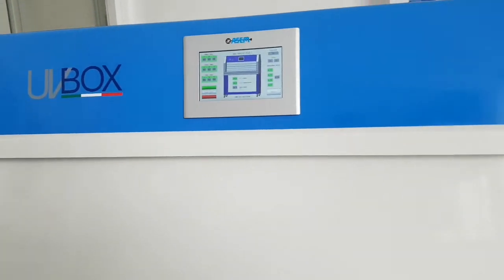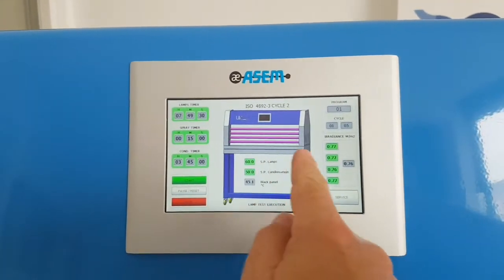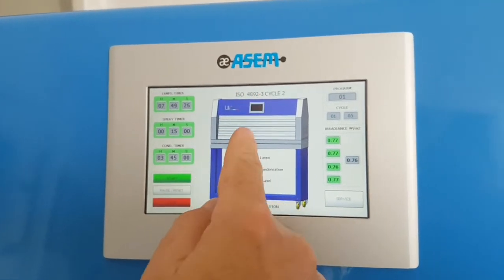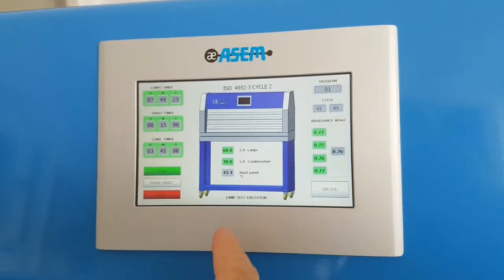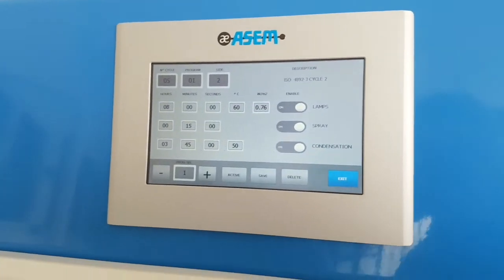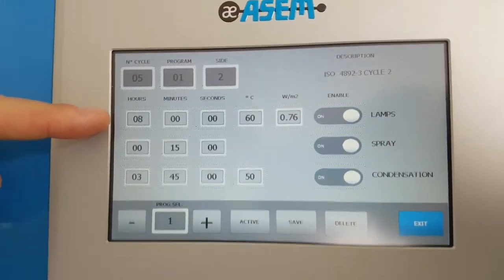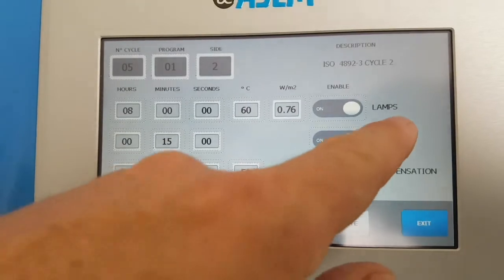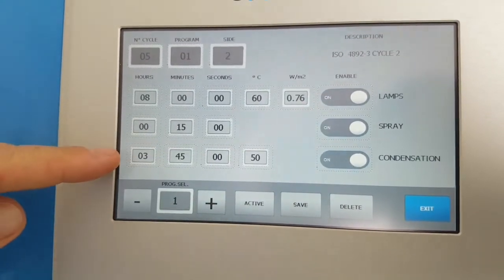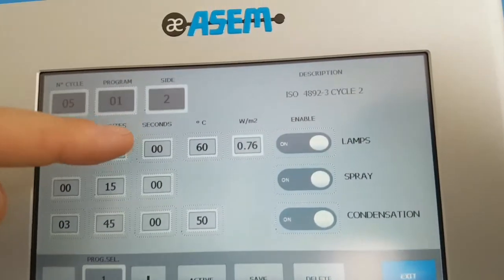Now we can see how to manage the control panel. In this case it is running a cycle: ISO 4892-3, cycle 2. You just click on the program and you see the description — in this case it is 8 hours of lamps, 15 minutes of spray, and 3 hours and 45 minutes of condensation.